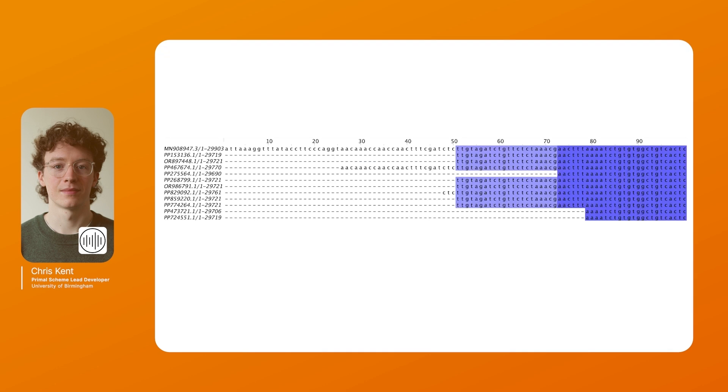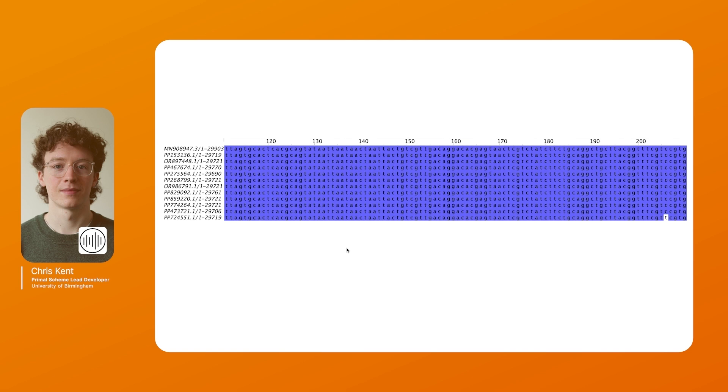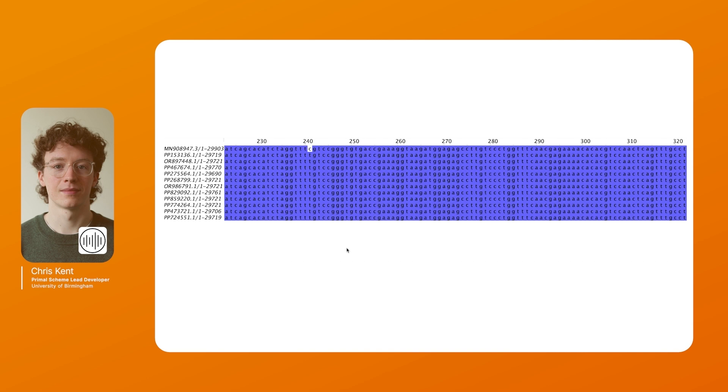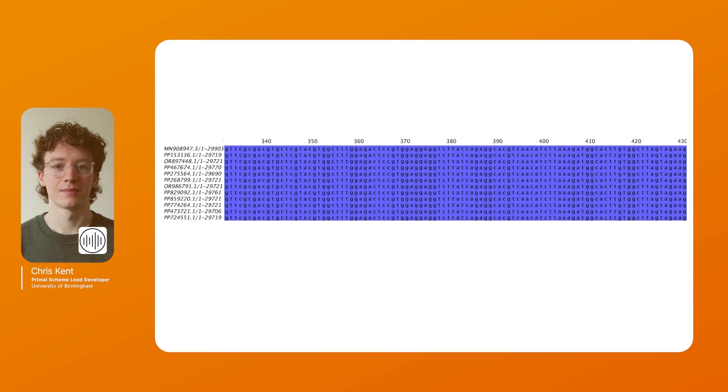So when you upload your files to Primal Scheme 3 it can be good just to have a quick QC of the files you're uploading to make sure they are aligned and they make sense. Here is the COVID file we talked about earlier. We can see in the first position we have the COVID reference genome followed by a bunch of genomes taken from NCBI. We can see that they align well with only a few variants noted.